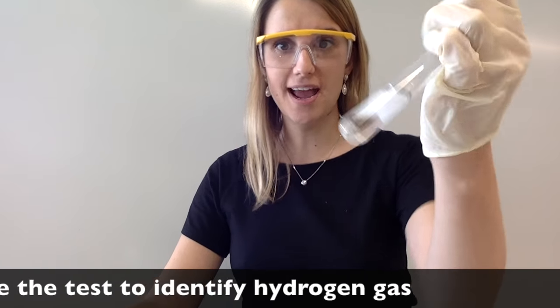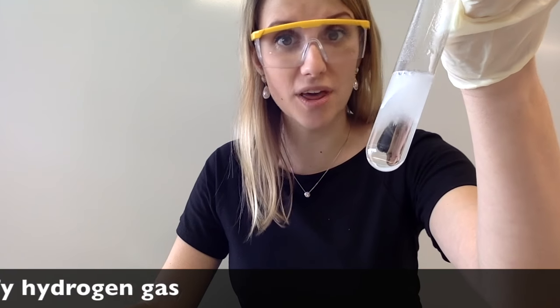Now what I've got is a reaction of magnesium with hydrochloric acid that makes H2, hydrogen gas.